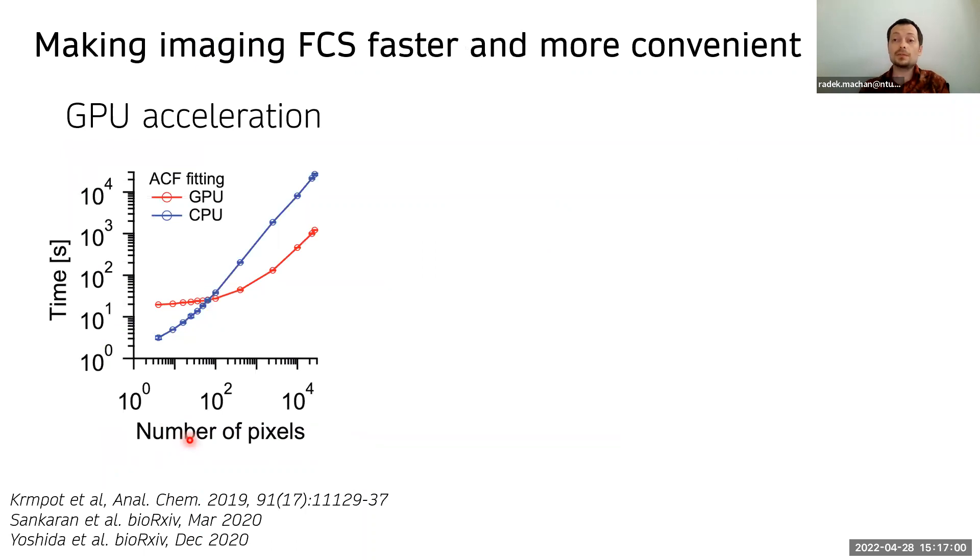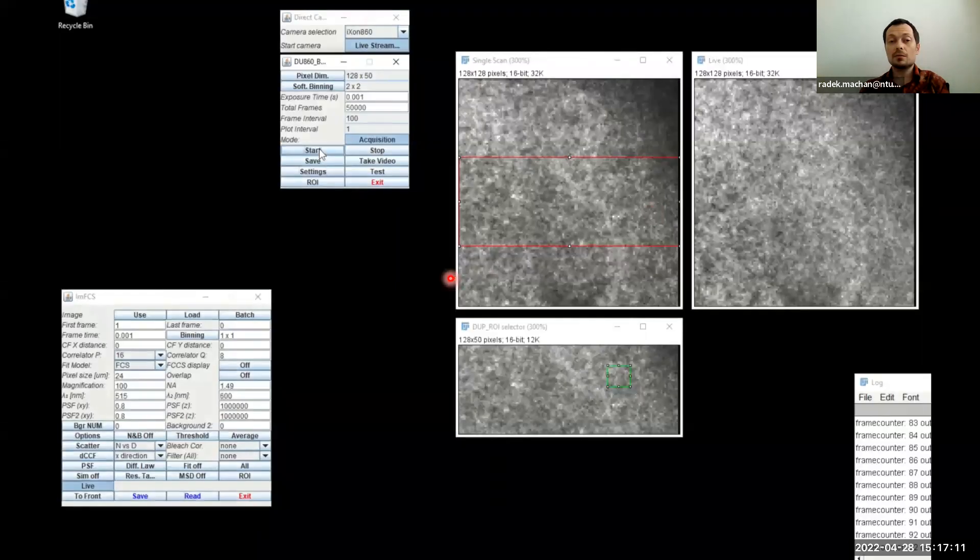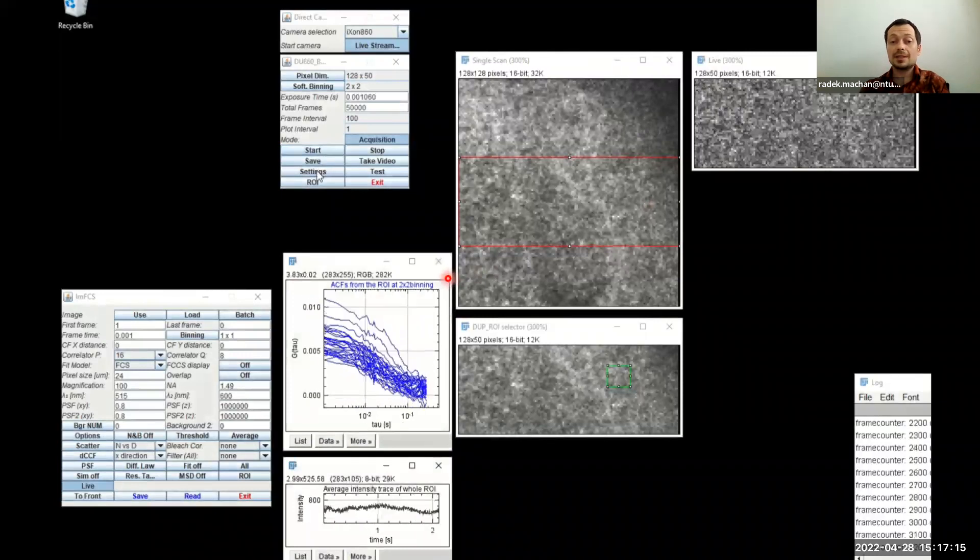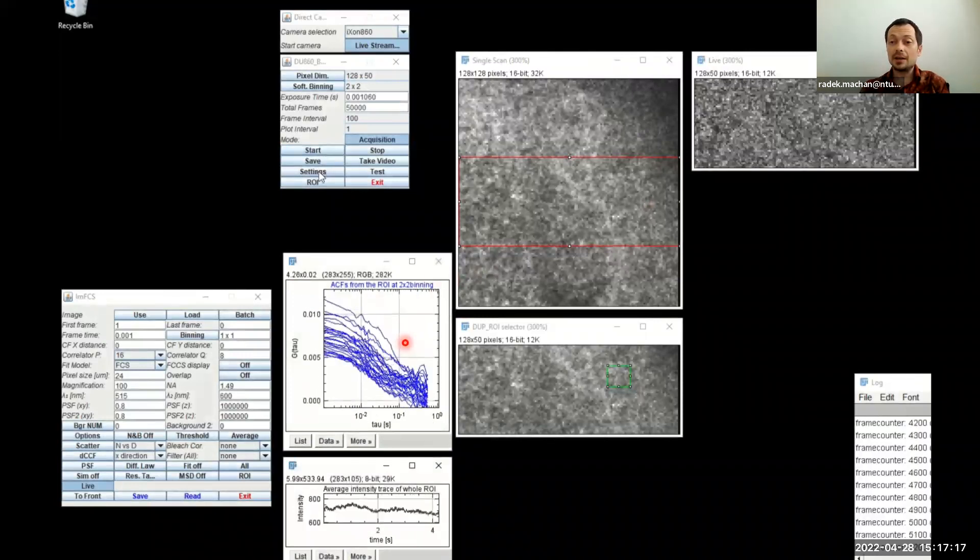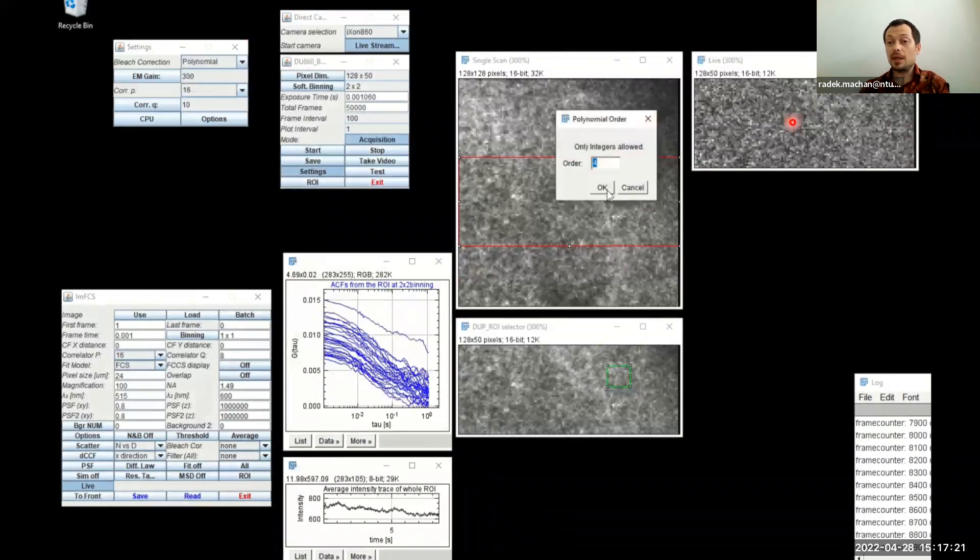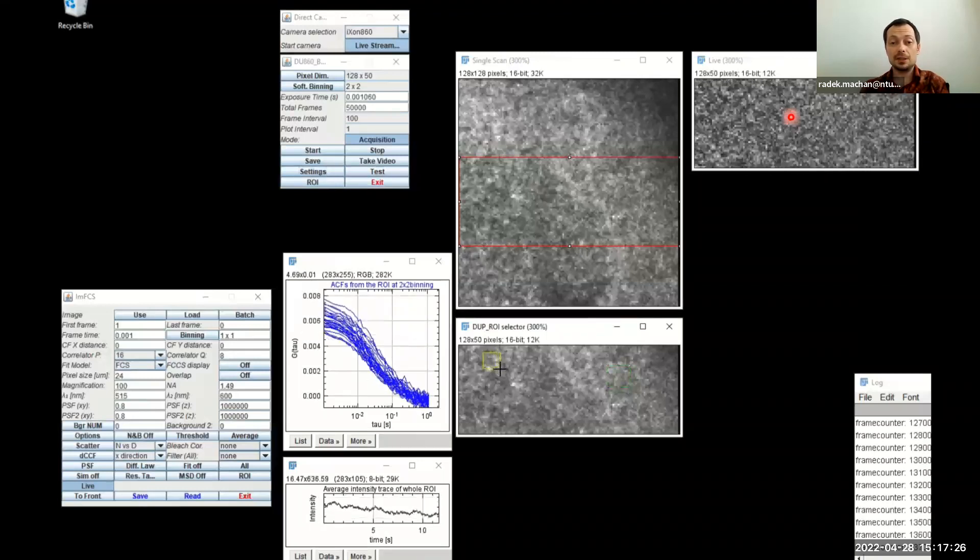The imaging FCS plugin keeps developing. So the latest version supports GPU acceleration as well as direct camera readout. This is very useful for optimizing the experiment because you can see the correlation functions directly while acquiring the images and not only after the acquisition has finished.